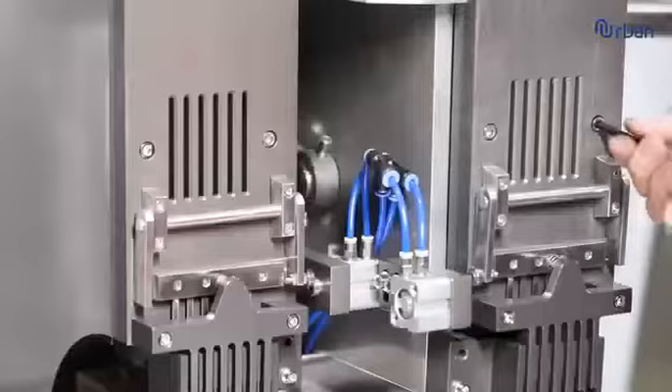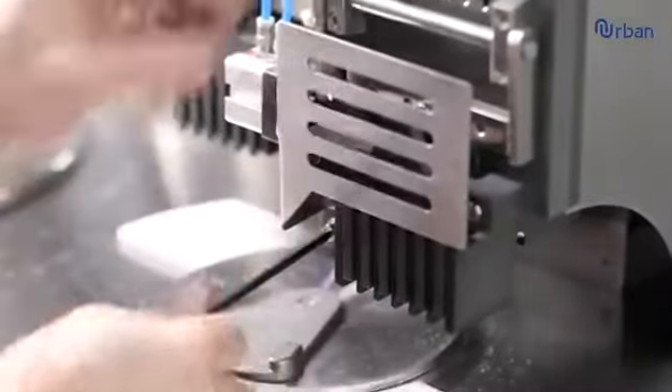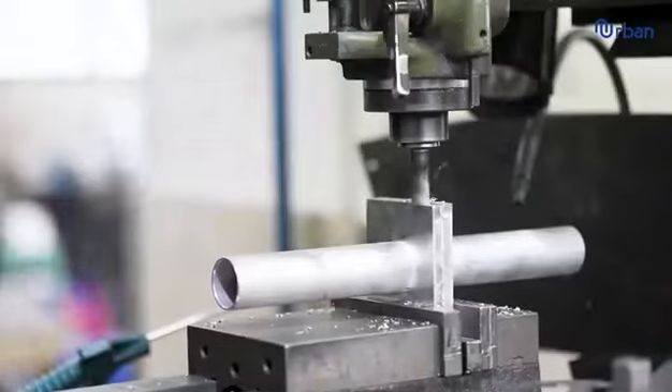We use high precision mechanical equipment to make the mold to match the capsule model perfectly, which is more convenient when you install or replace the mold.